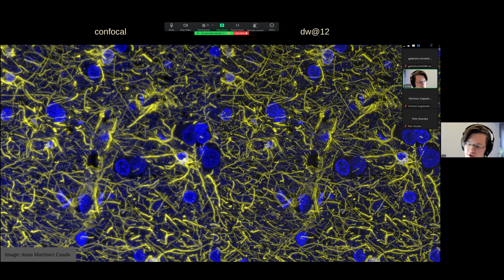So you could get results that look a little crisper, but also here it's maybe even too many iterations because I think I see, at least it looks a little more spotty, and it doesn't look that calm to the eye. Maybe it's true, maybe it's not. So if you need to know, you would have to compare with super resolution.